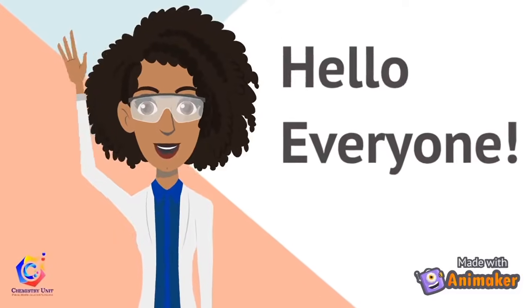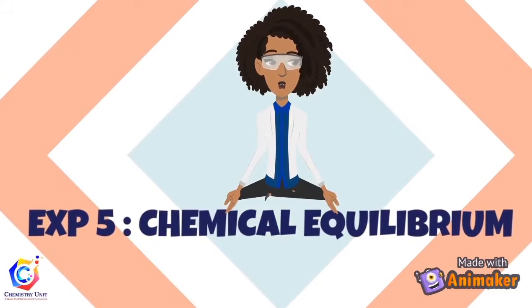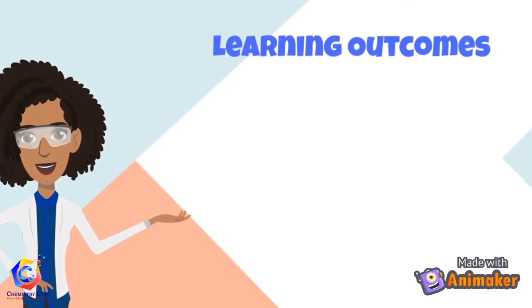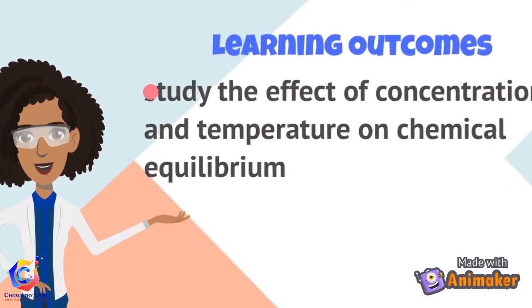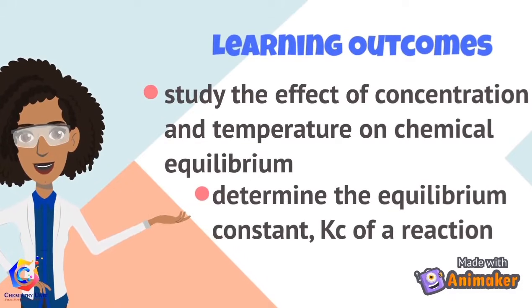Hello and hi everyone. Today we are going over experiment 5, which is chemical equilibrium. Let's go to the learning outcomes of this experiment. First is to study the effect of concentration and temperature on chemical equilibrium. Second is to determine the equilibrium constant of a reaction.